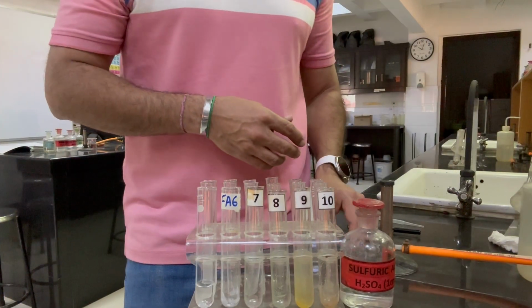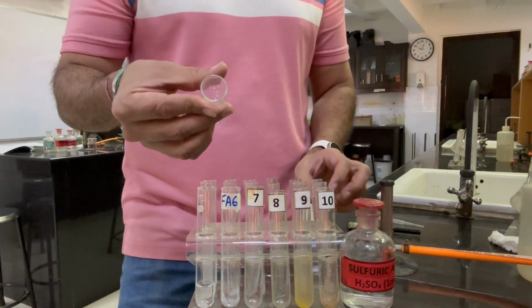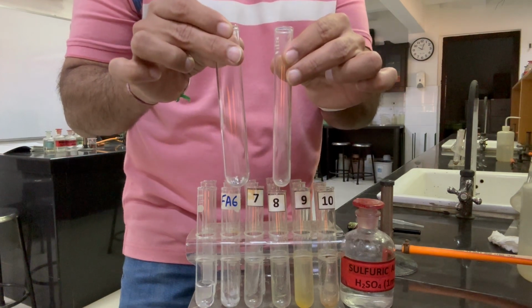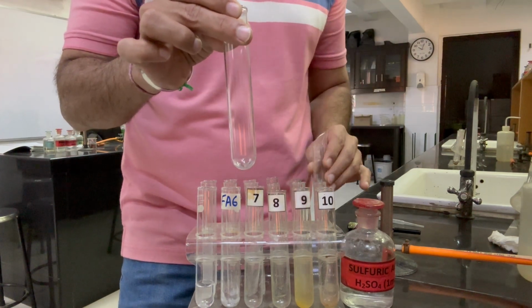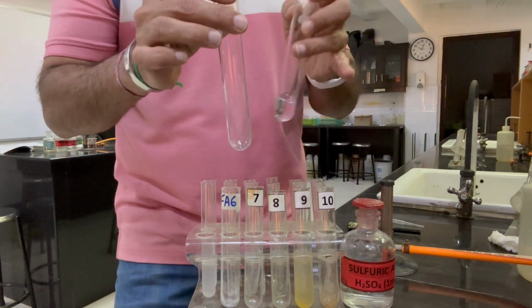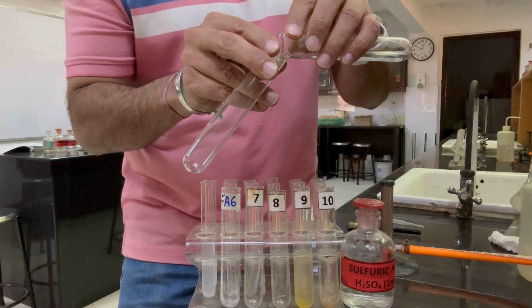We will take a boiling tube, which is a bit thicker than the normal tube. You can see this is a thick tube made of Pyrex for heating purposes. We will take 1 centimeter depth of our Fa6 solution in this boiling tube.